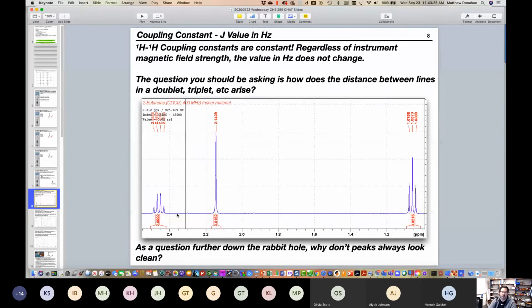We've said prior that the methylene and the methyl group see each other, right? Because they're neighbors. So this distance is called a coupling constant. It's going to have the same distance as what it's coupled to over here in the neighbor. So within the peak itself, and then with whatever it's coupled with, they're going to have the same distance. Yes, all sigma bonds have free rotation.